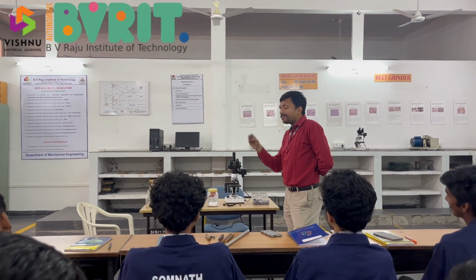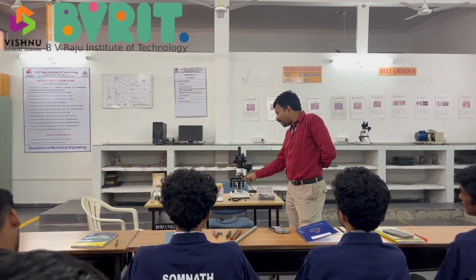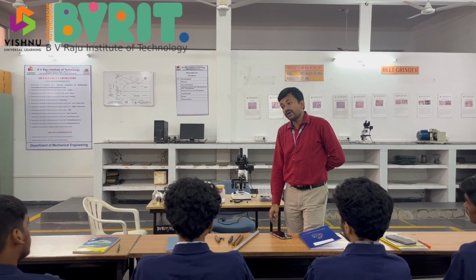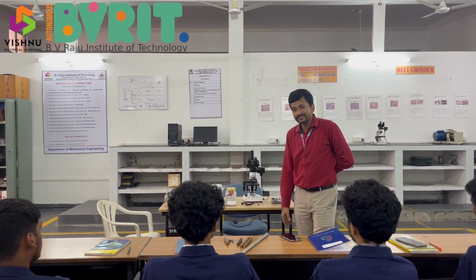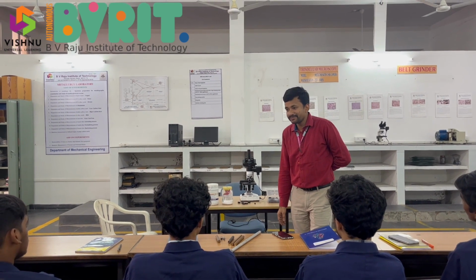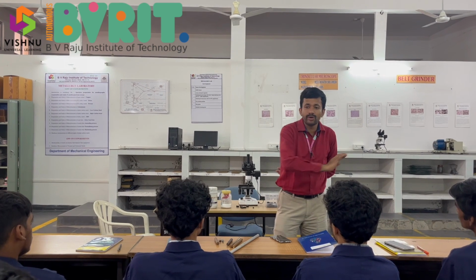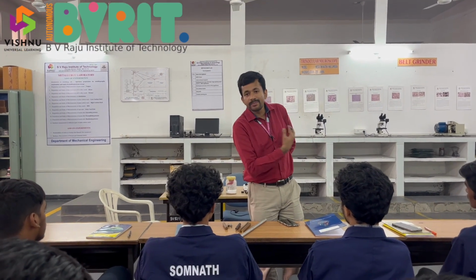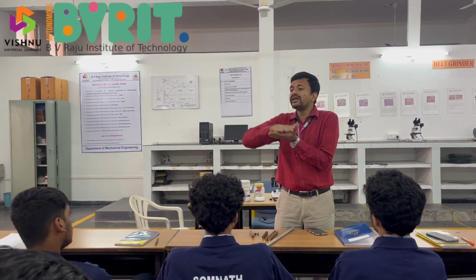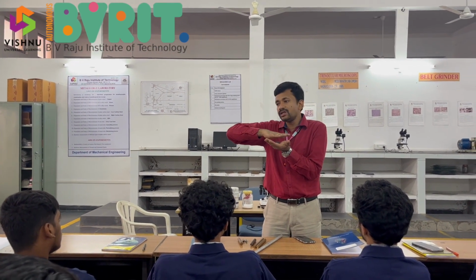After preparing the specimen, if I keep it under the microscope, what will I be able to observe? Microparticles, grain structures straight away? First thing is, soon after taking it out of the hydraulic mounting press, it will be so irregular and it will not be uniform in all aspects.